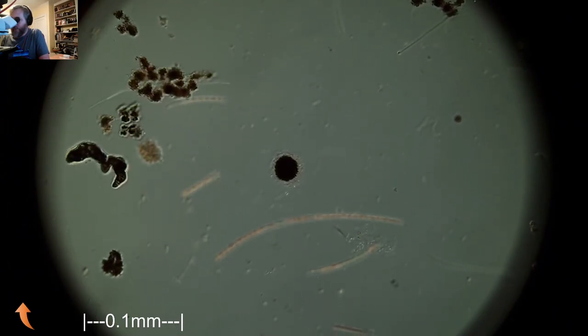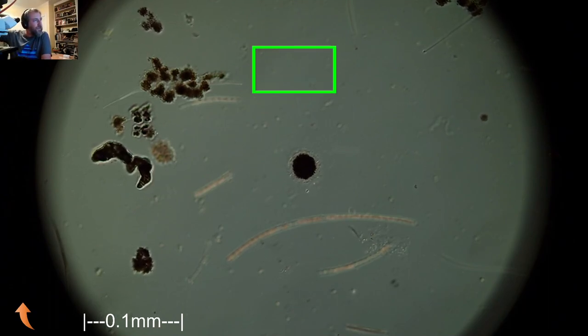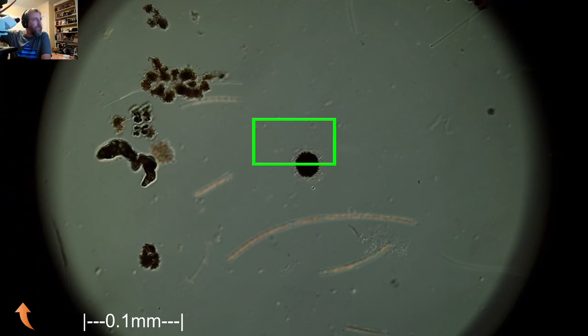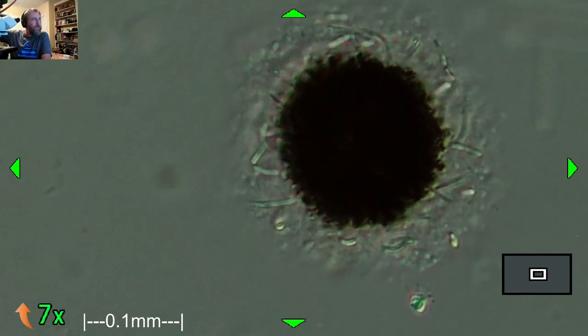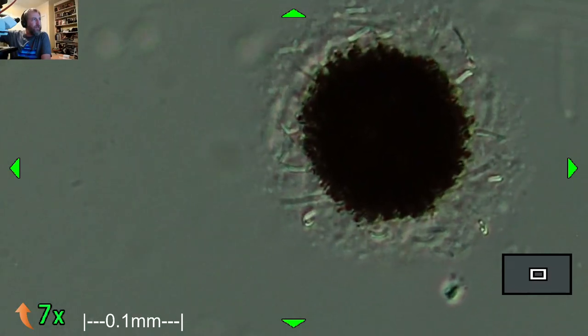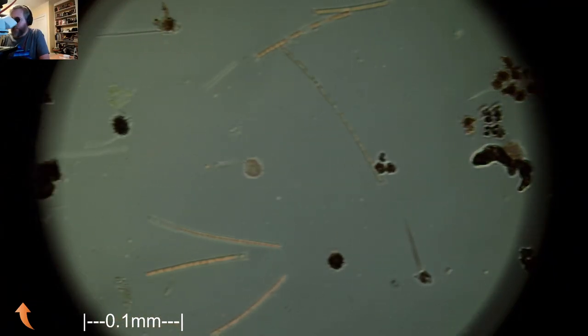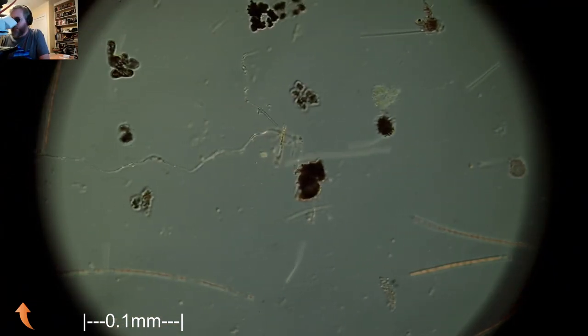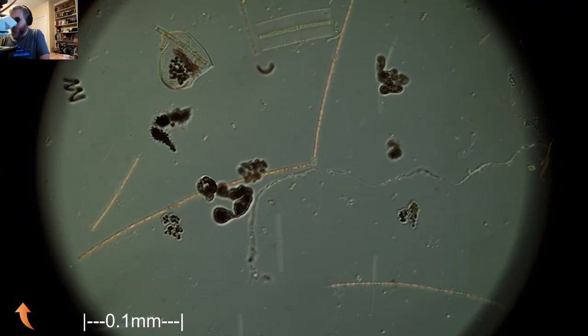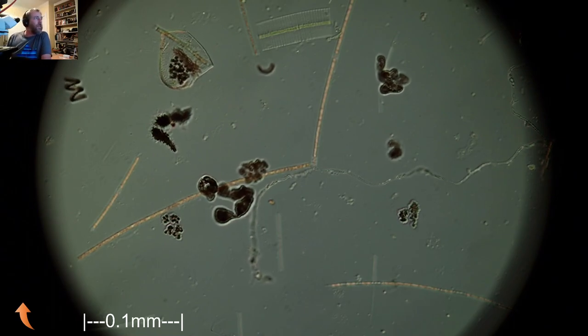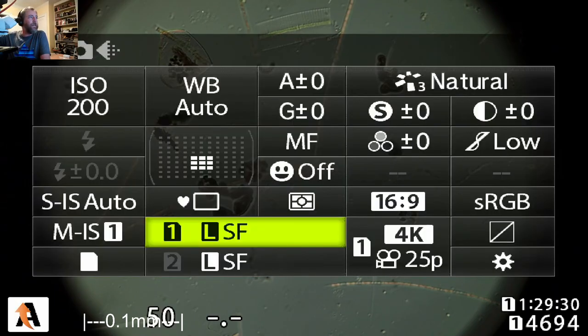It looks like it's maybe dead. I don't see any of the pseudopods sticking out. But that's a tested amoeba. That's the test, and potentially a little bit of what it was eating. I've seen a bunch of the tests for the tested amoebas in these samples. And I think this little guy is another type of cyanobacteria. This one that's here. So for a lake that they're trying to keep clear, really it's got a lot of kind of troublesome algae. Chlorella. This long colony of cool shaped little zigzaggy thing up here.